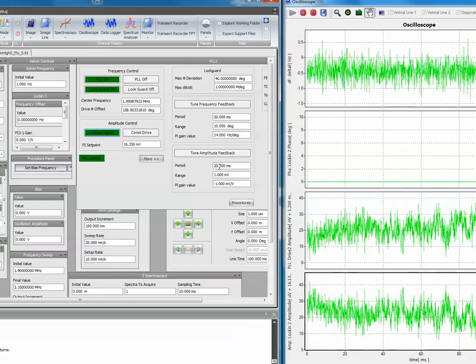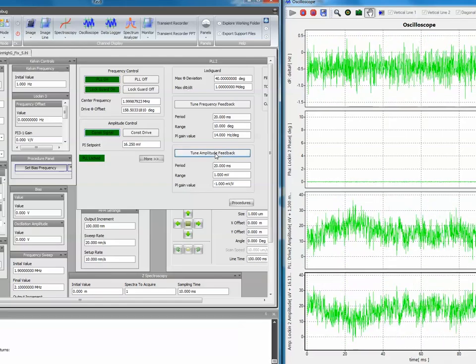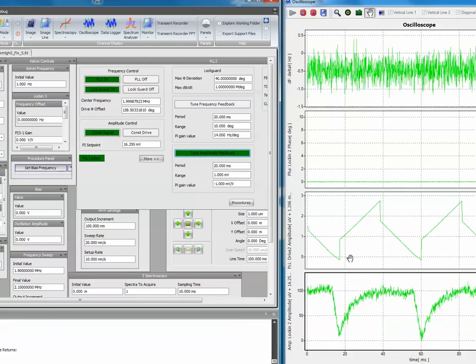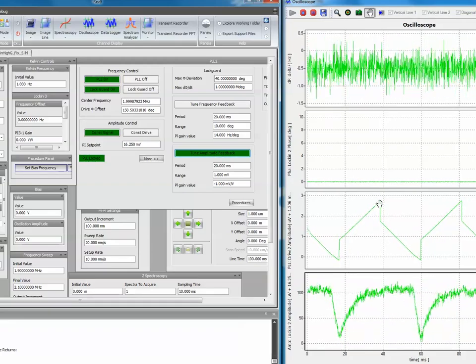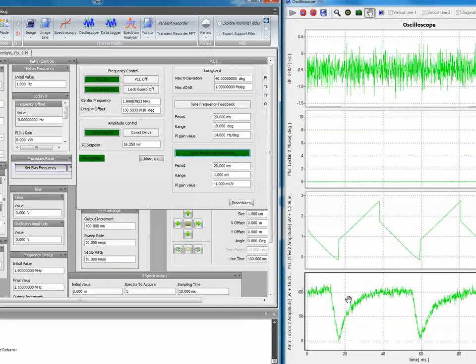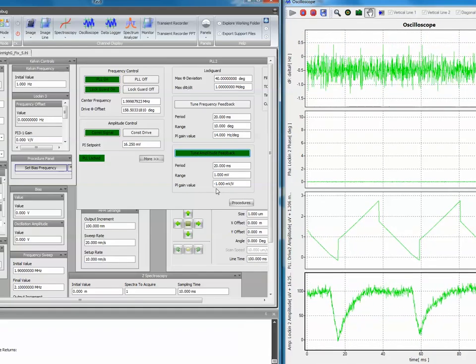And this happens every 20 milliseconds. I have set a particularly low PI gain value just for demonstration. This will look like this. Just like in the frequency control, we see the action of the P and the I control here. We're way far away from a good control. We don't reach set point here at all. This is a way too low PI gain value.